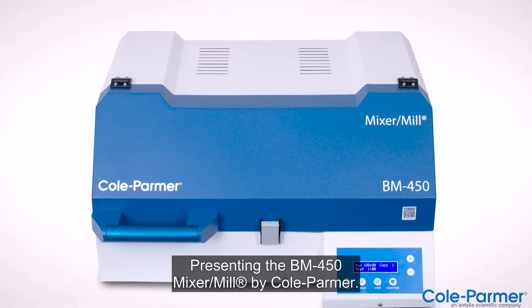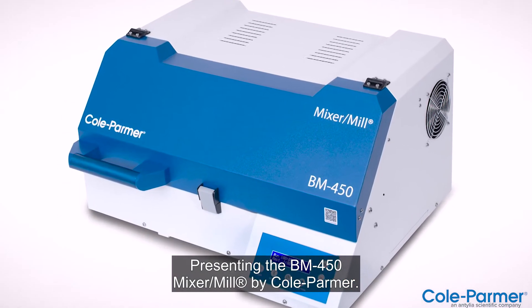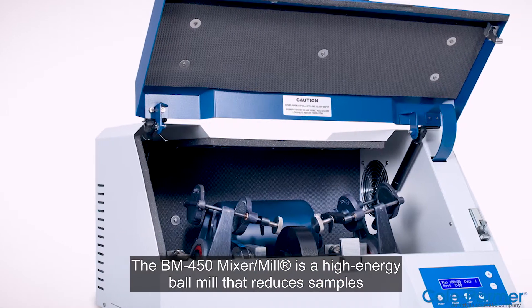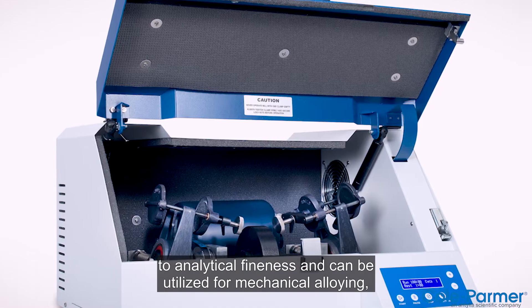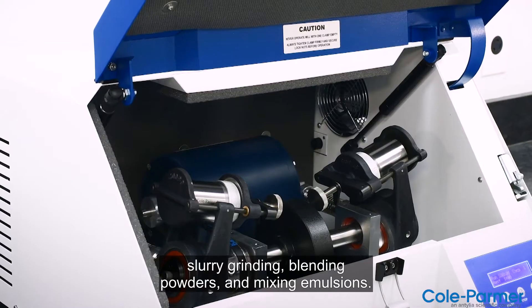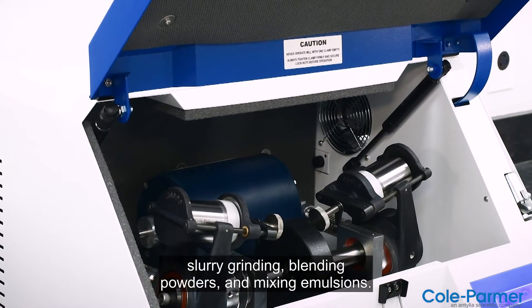Presenting the BM450 Mixer Mill by Kohl-Parmer. The BM450 Mixer Mill is a high-energy ball mill that reduces samples to analytical fineness and can be utilized for mechanical alloying, slurry grinding, blending powders, and mixing emulsions.